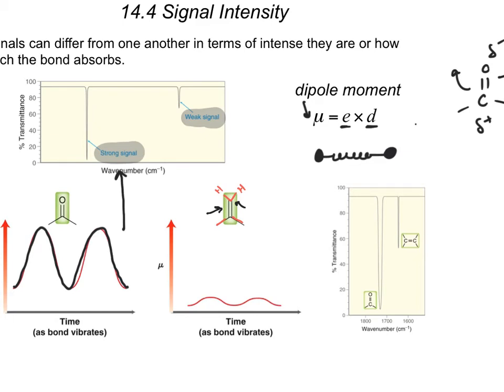So now, let me highlight this carbon-carbon double bond, because that's what we're looking at. Would you say that's a polar bond? No, you wouldn't, because it's carbon-carbon. It's usually fairly nonpolar. Is there still a slight difference in electronegativity, though? Yeah, because this carbon is attached to a hydrogen, whereas this carbon is attached to a carbon. So even though this is nonpolar in our canonical polarity idea, it is still slightly polar. Tiny, tiny little bit, so we get a partial negative up here and a partial positive up here. That difference in charge is much, much smaller, right?